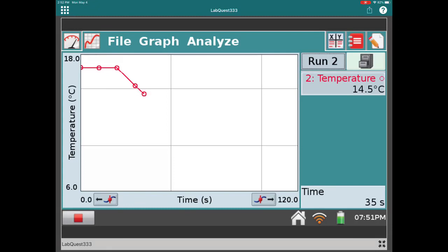The temperature is being recorded by the LabQuest every five seconds, and the experiment runs for a two-minute interval — 120 seconds. On the right side of the screen you can see the temperature and time displayed. We see an initial quick drop in temperature as the alcohol evaporates from the filter paper, and then as time progresses, the rate of evaporation seems to be slowing down. The graph seems to be plateauing a little bit.